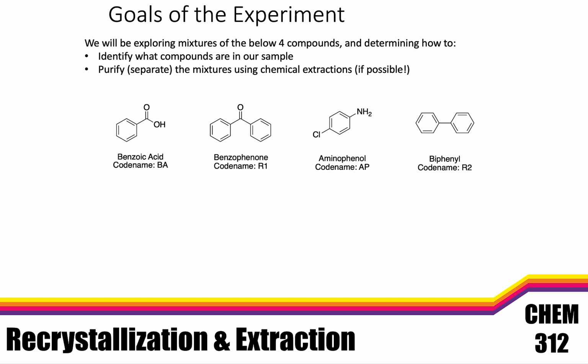And this is what we're going to be exploring in our chemical extraction video. So take some time, watch both of the experiment videos, work on the PDFs, and we'll see how we can change solubility and use that to purify compounds and study them.